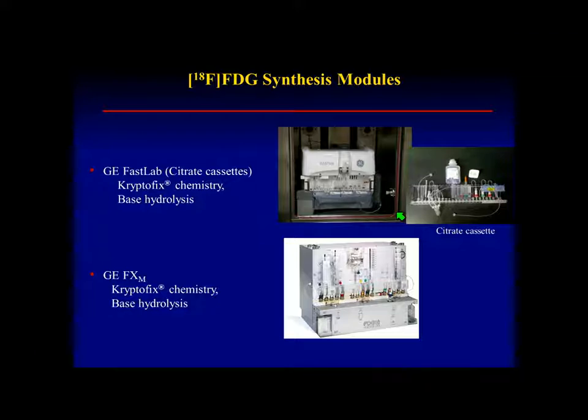On the first Monday and Tuesday, we may only make 1 batch, sometimes more, depending on patient load and how late in the day we have to go. Because a 4 o'clock dose can make us have to have 500 millicuries or 700 millicuries at 7 o'clock in the morning when we let the batch out. So we can usually cover it if they're up to 3 o'clock in the afternoon, otherwise we have to start making another run.